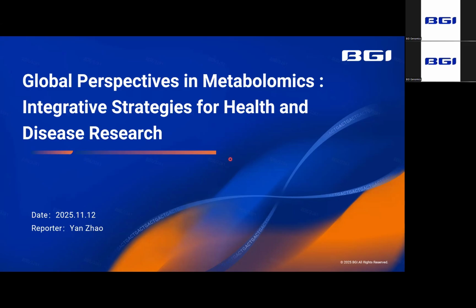I'm Zhao Yan, and I'm truly glad to connect with colleagues from worldwide. I work at BGI Genomics as a field application scientist, where we collaborate closely with academic and clinical partners to translate multi-omics data into biological insights. In this session, I'll walk you through the place of metabolomics within multi-omics precision medicine, analytical strategies, untargeted, targeted, and semi-targeted, workflow and data quality assurance, integration across omics layers, and a few case studies and closing remarks.